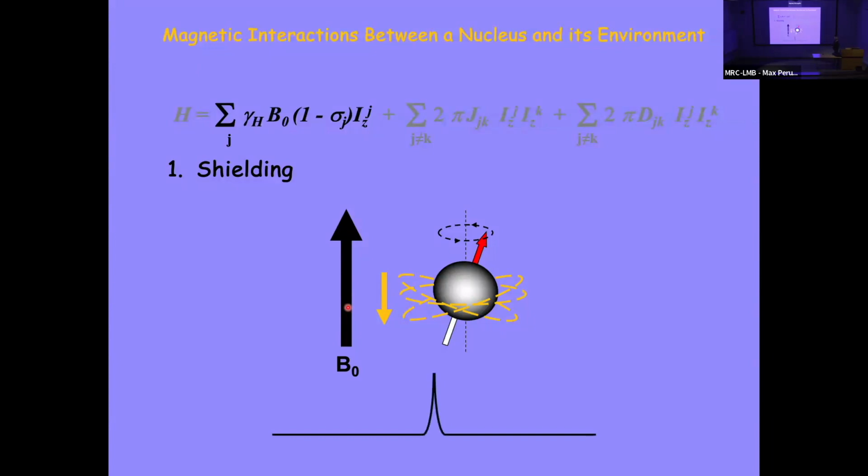So we get a signal, and as we said before, we depict that frequency axis as the chemical shift axis. Every nucleus in the molecule will have its own different environment. This density of electrons obviously is most strongly affected by functional group chemistry. So this is why NMR is beautifully adapted to work out the chemical composition of molecules.